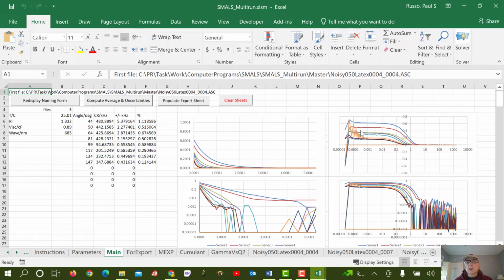They look okay. Notice that here we have one really seriously errant detector. And we're going to have to eliminate something like 1, 2, 3, 4, 5, 6, 7, 10. Maybe the first 15 points will be eliminated, at least for that detector, but really there's no reason not to eliminate points lower than that for any of the detectors. But otherwise, it's okay. I mean, there's a little flattening here at the end, but that's 1, 2, 3, 2.5, 2 and change powers of 10 before that's happening. It looks basically okay for such short runs.